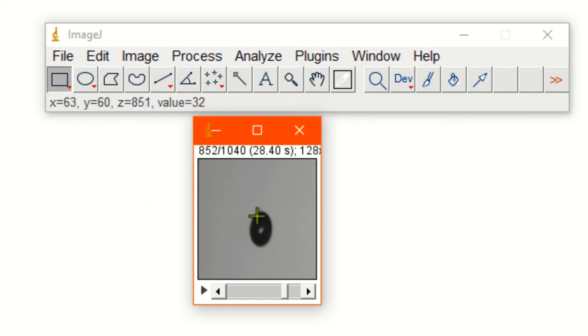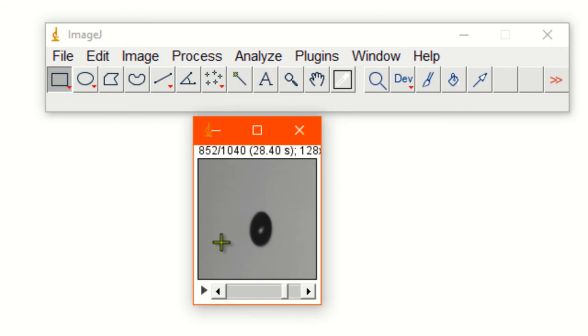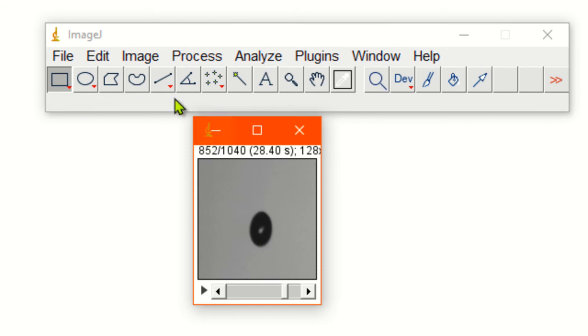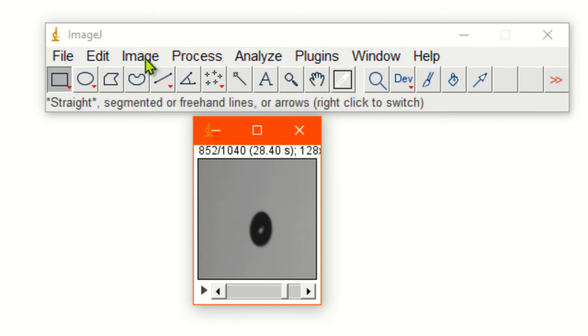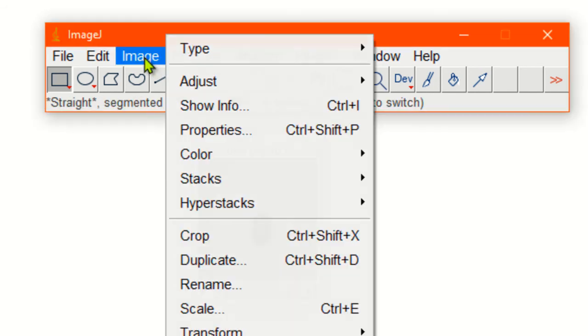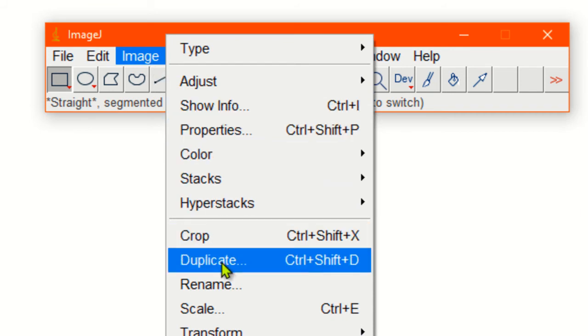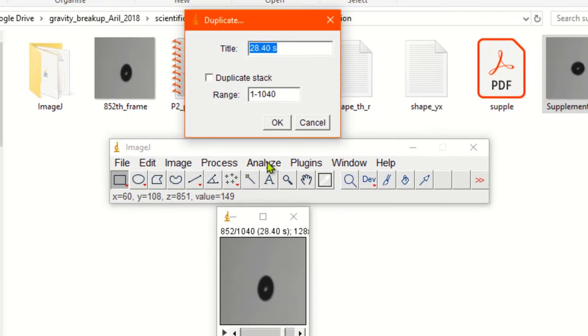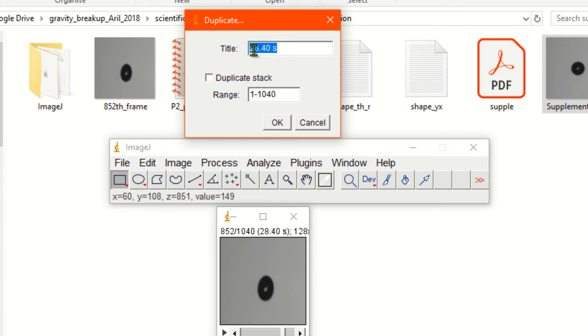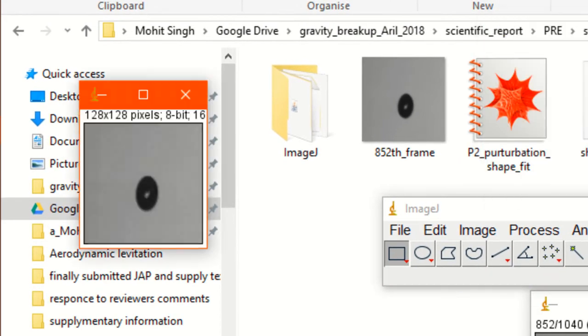I'm just selecting 852. You could select something else. This is the drop you want to find out its boundary. So what we can do is duplicate this particular frame. Just go to image and click on duplicate.